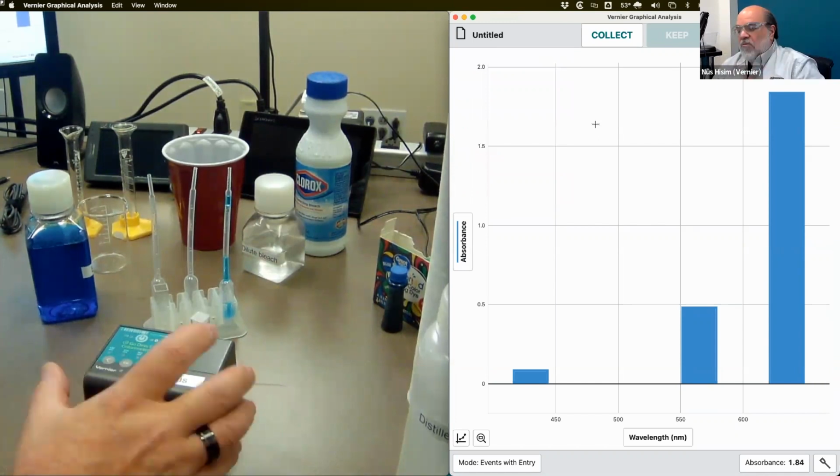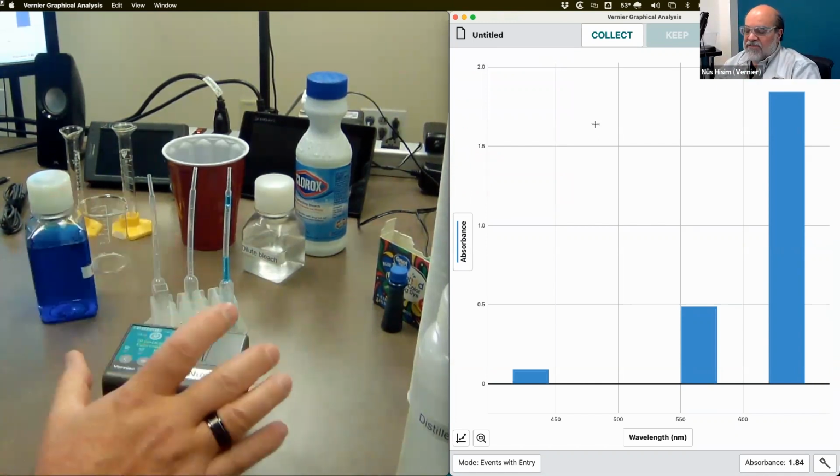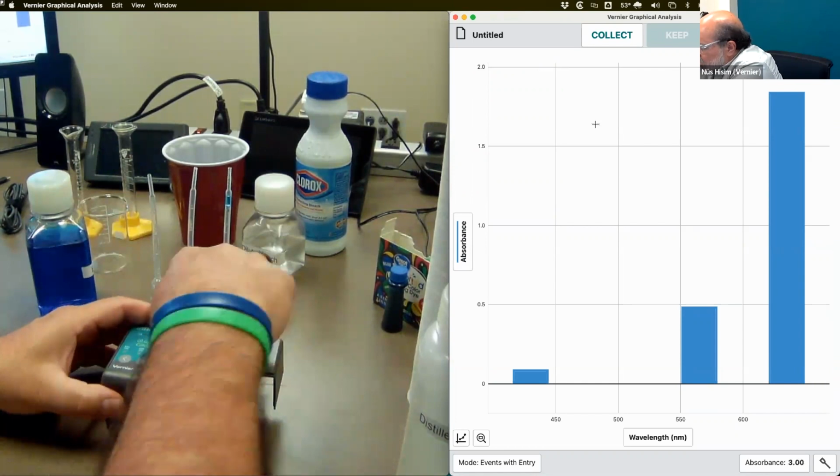Okay. So part 1, we now know that 635 is a good wavelength to use. Let me get that cuvette out.